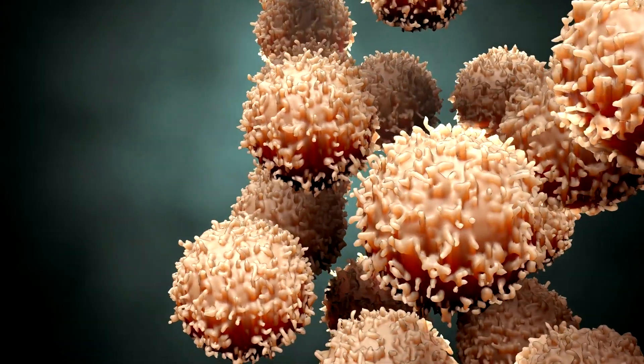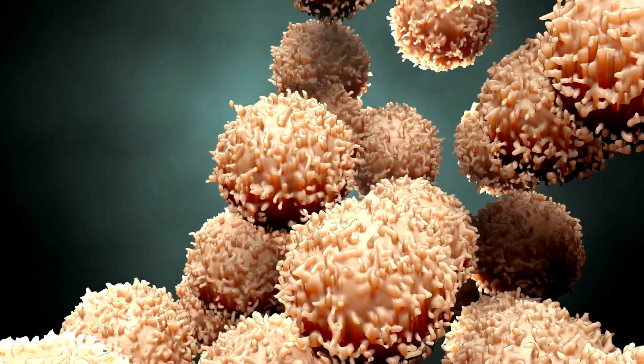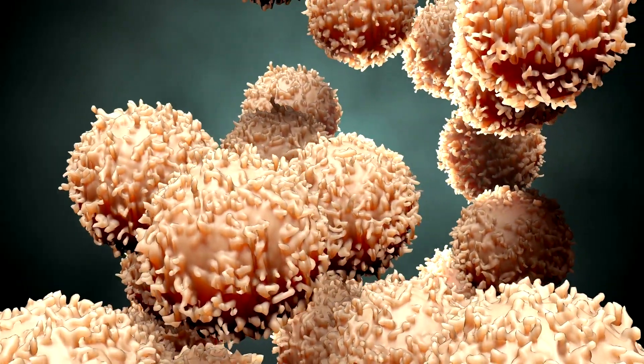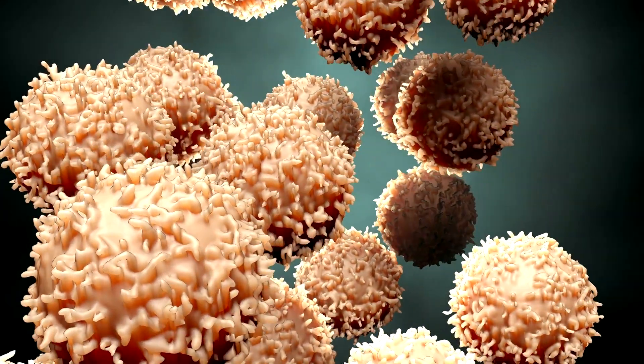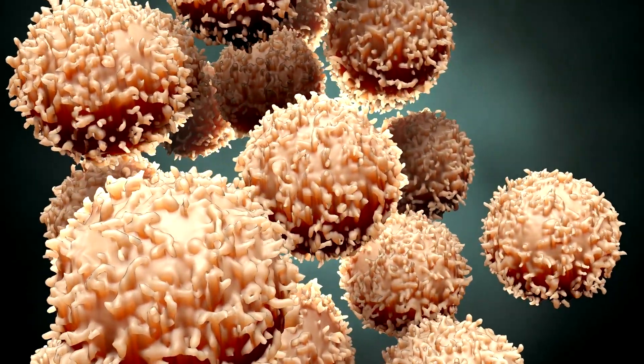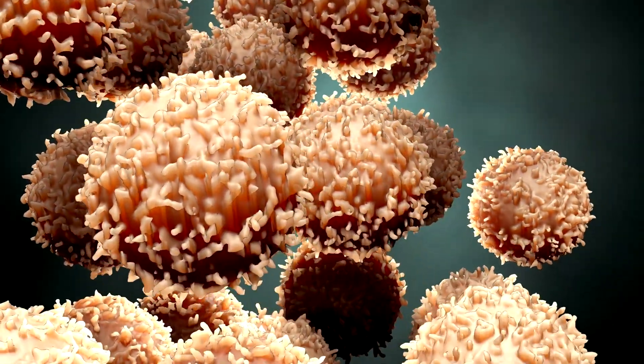Understanding the functions of intracellular organelles, compartments, and other structures requires visualization of their organization and interactions. To see beneath the surface of structures, volume electron microscopy has proven essential for 3D bioimaging.